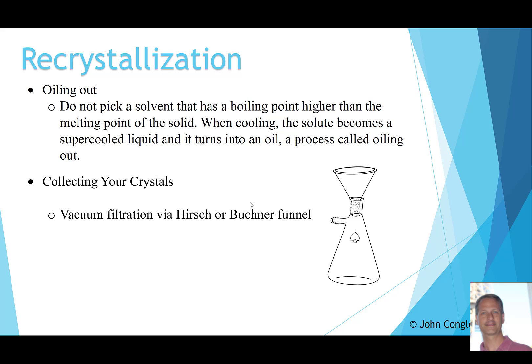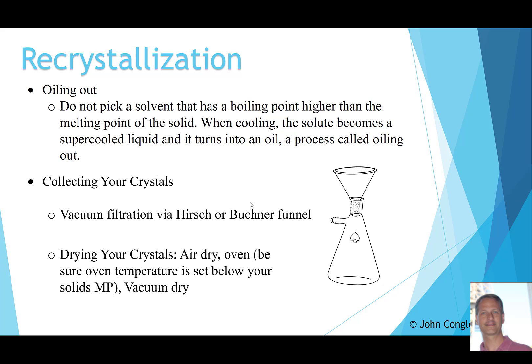When collecting crystals, we typically use a vacuum flask and a Hirsch funnel, or sometimes a Büchner funnel, to vacuum-filter and collect the solid. The crystals then need to dry: allow them to air dry, use an oven set below the solid's melting point, or vacuum dry by continuing to run the vacuum and crushing/moving the crystals around, which can yield a dry sample fairly quickly depending on the solvent used.